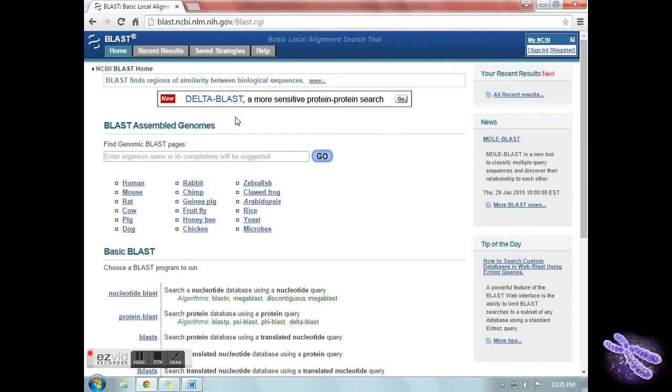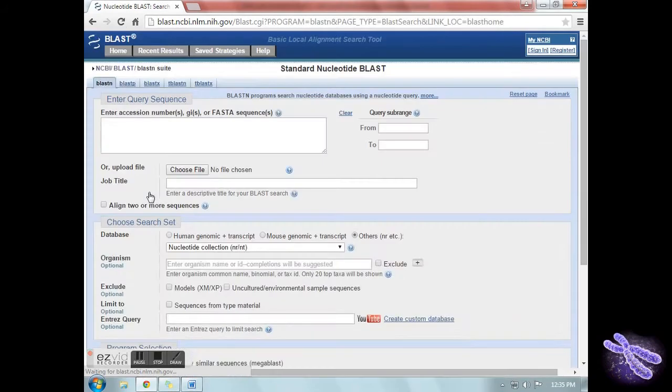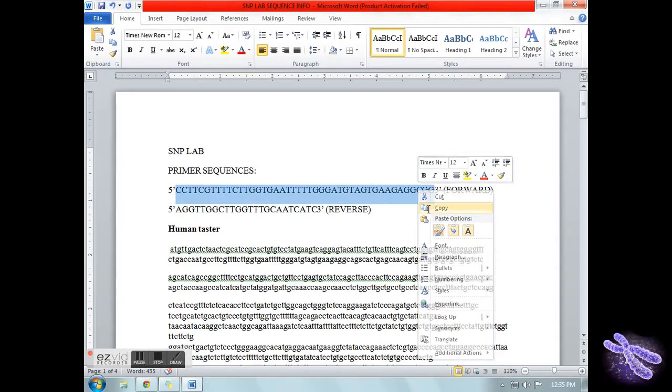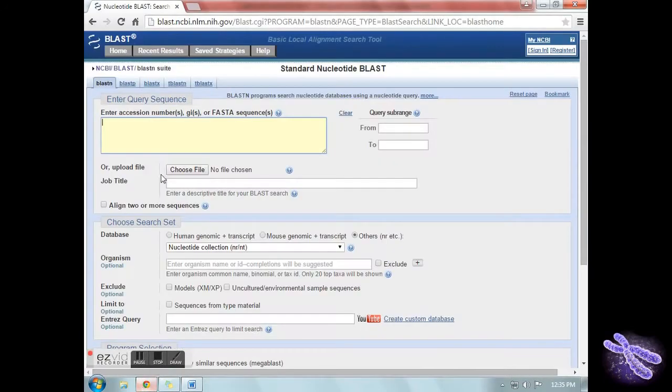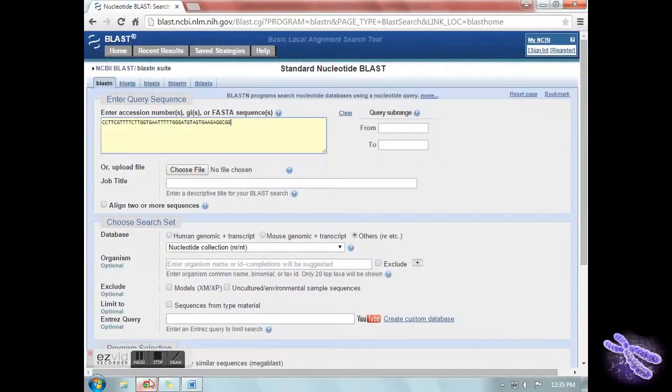Click on Nucleotide BLAST. In the search bar, enter the primer sequence.